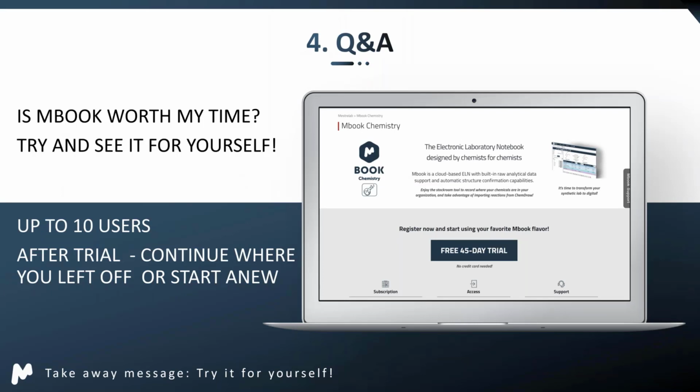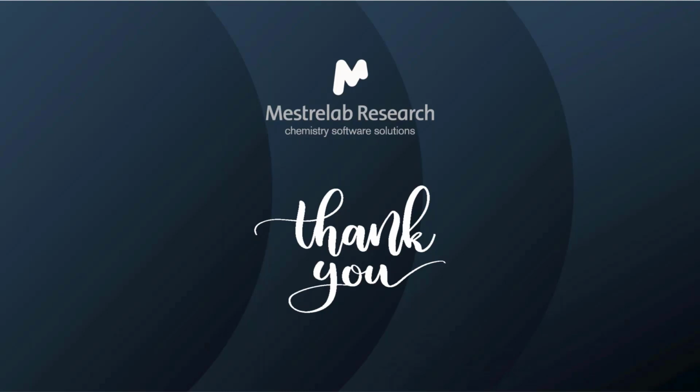So with this, I would like to thank you for your attention and leave you with the takeaway message. Is Mbook worth your time? Well, try it and see for yourself. You can try it by clicking on the button here, and it's up to 10 users. And after the trial, you can either continue where you left off, or you can start completely new. So you can have it as a playground and really play with it. Thank you for your attention.